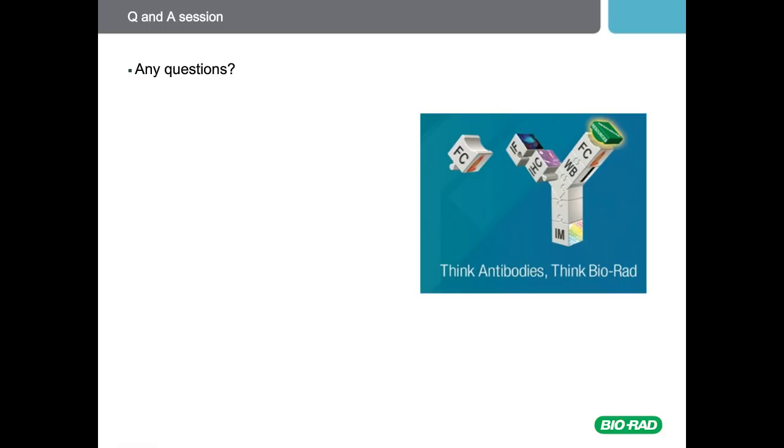I would recommend using fluorescence minus one when you're using more than 4 or 5 colors, and this will allow you to gate and show your fluorescence spread. I will go into controls such as fluorescence minus one and isotype controls in another seminar later in the year.